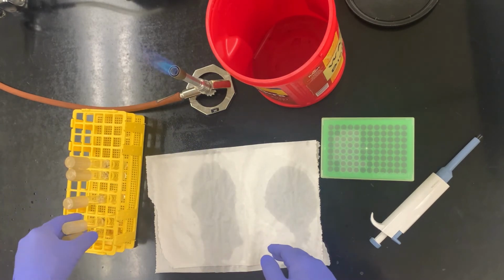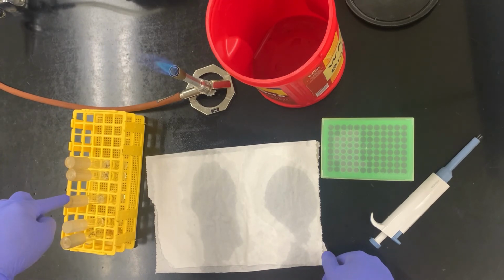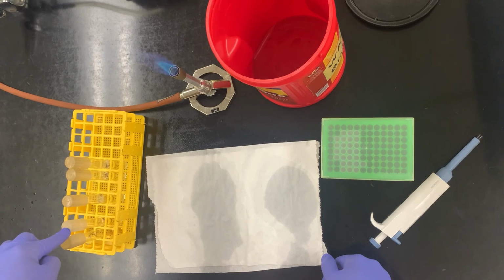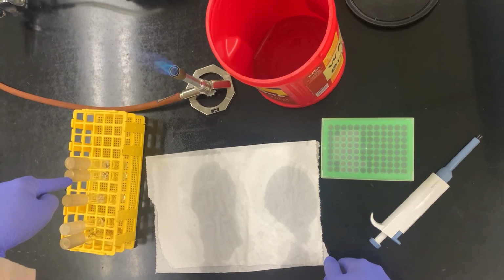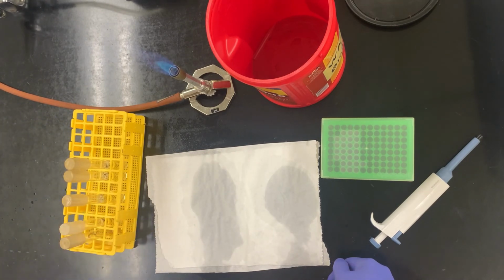Every time we do that, our 10 to the minus 1 tube has 10 times less bacteria than our broth. Our 10 to the minus 2 tube has 10 times less than our 10 to the minus 1. 10 to the minus 3 will have 10 times less. 10 to the minus 4 will have 10 times less. And every single time we do this, we create a solution that has 10 times less bacteria.